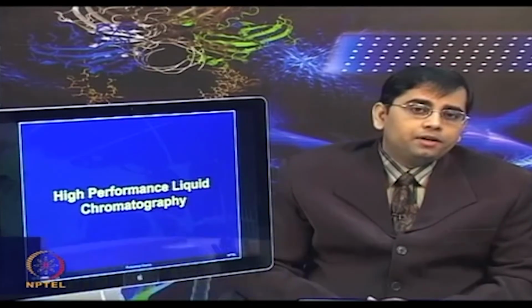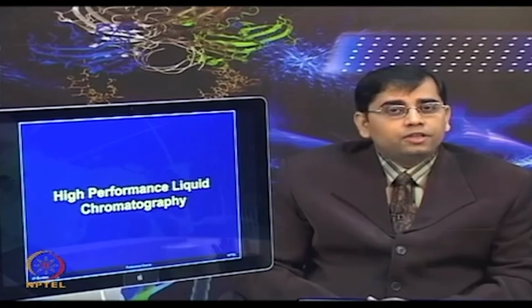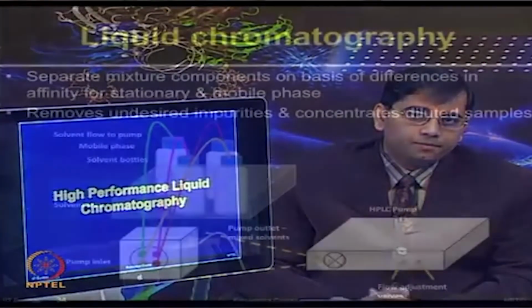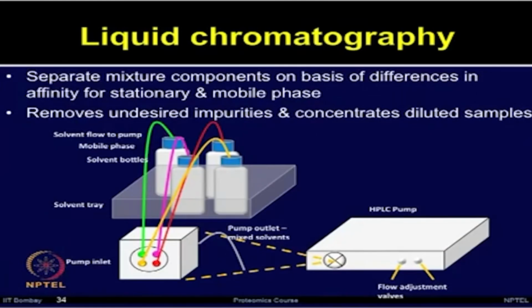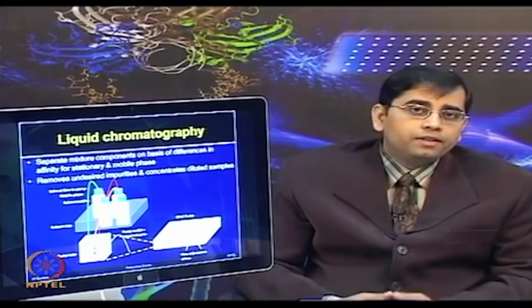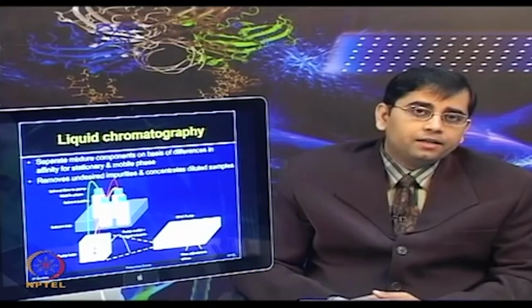Better separation and resolution of the components can be achieved by HPLC. So, what is liquid chromatography? Liquid chromatography separates mixture components on the basis of differences in their affinity for the stationary and mobile phase. It can remove the undesired impurities.